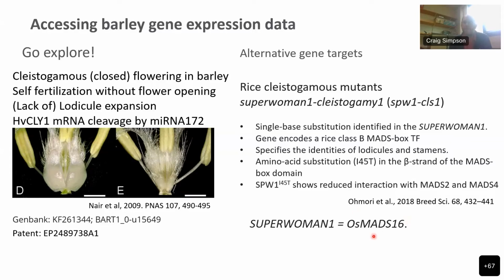So what I'm going to do is look for a MADS16 in barley.